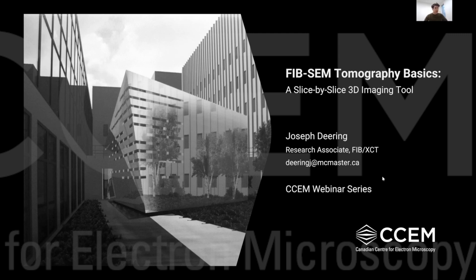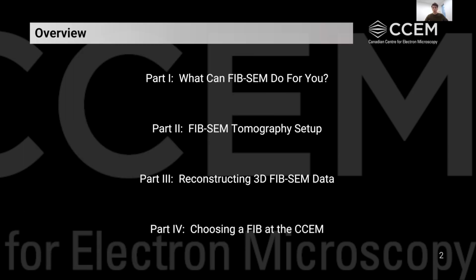So today my webinar is going to be broken up into four main components, the first of which is a little bit of an investigation as to what FIB-SEM can do for you. So what are you actually able to image using the technique?